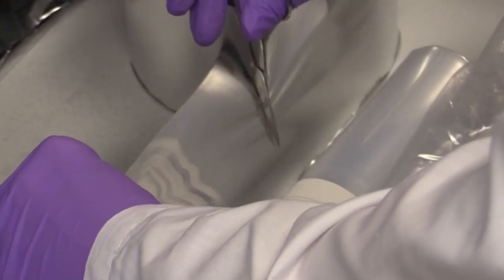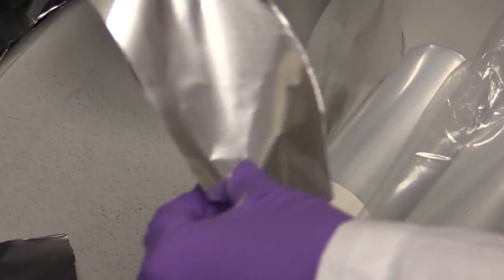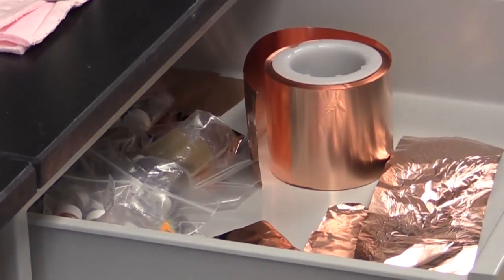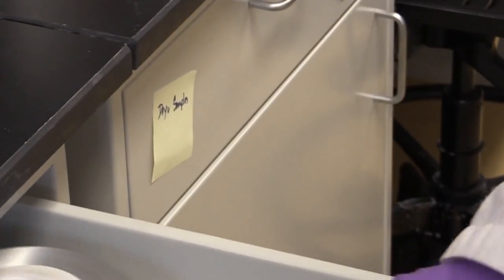Since we're casting a cathode material, we'll be using aluminum foil. This is battery-grade aluminum foil. If we were casting an anode, we would be using copper foil, which would be this one. But we're doing lithium cobalt oxide, so we should be using aluminum.